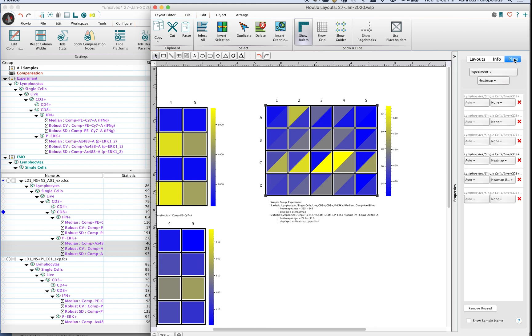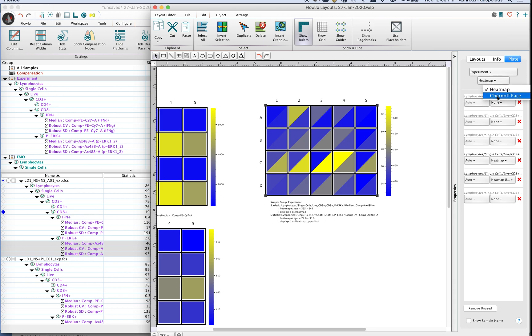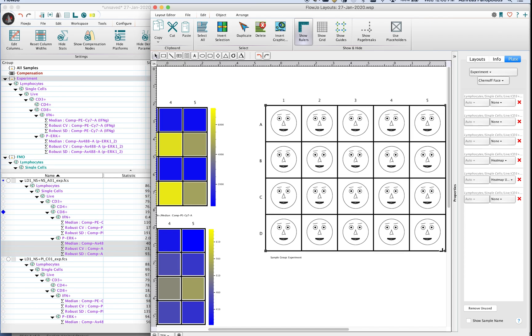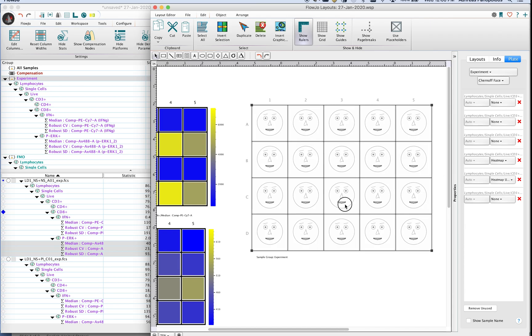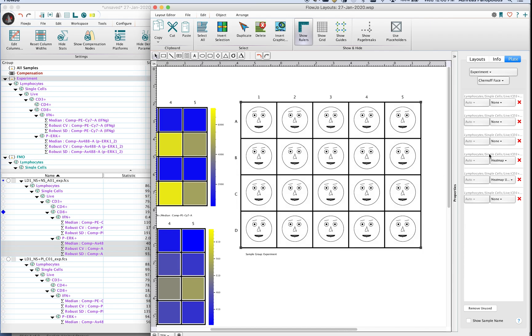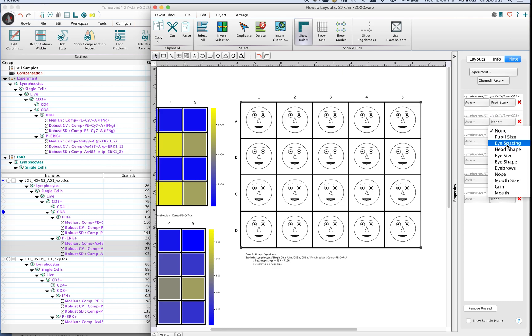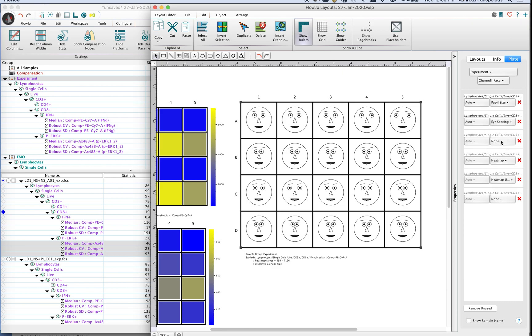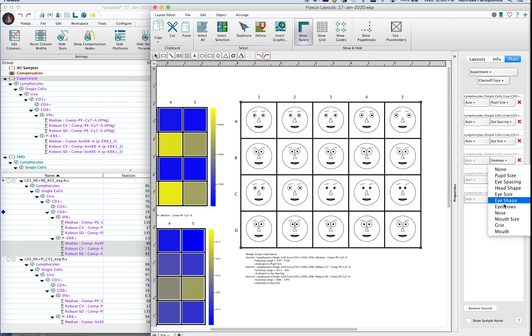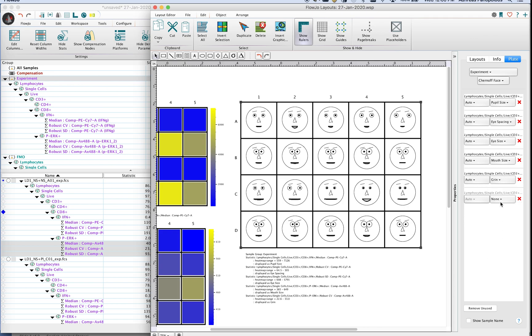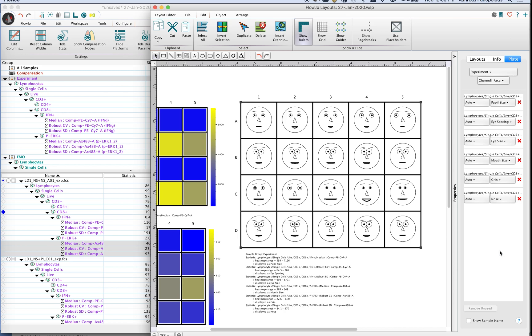However there is a mode change for the heat map here. So instead of looking at it as a heat map you can change this over to a Chernov face. This will make a human face that you can tether your various statistics to. So in this case I'm going to tether eye size and eyebrows and maybe a mouth size and a grin and maybe the nose as well to different statistics.